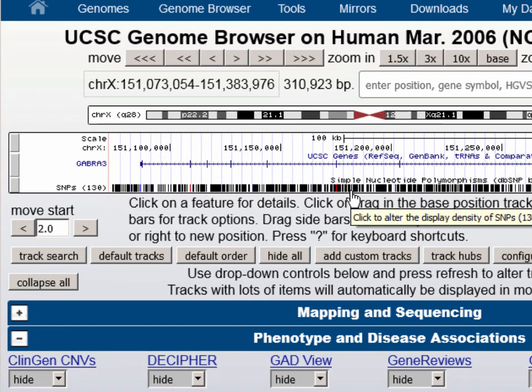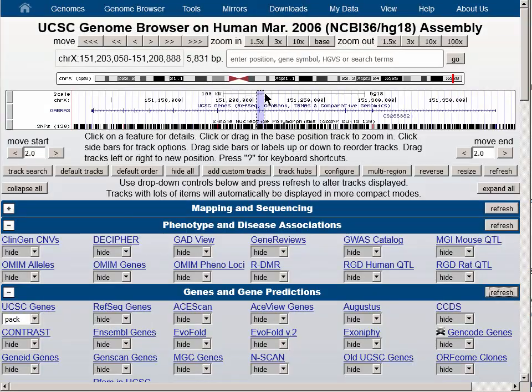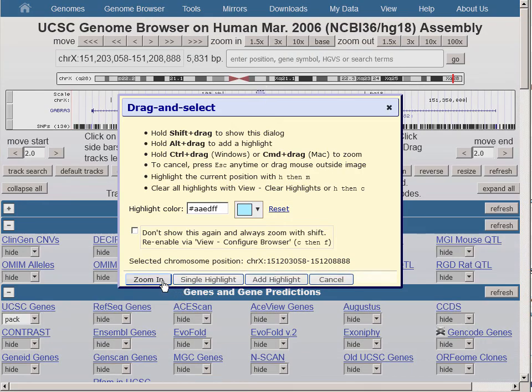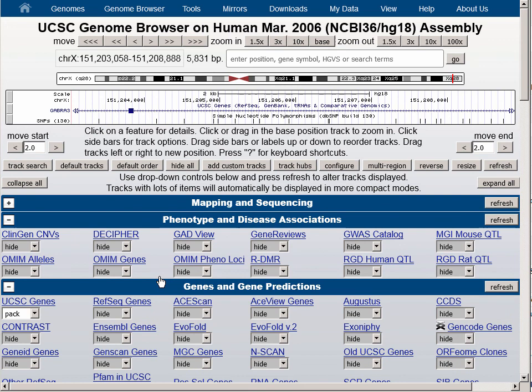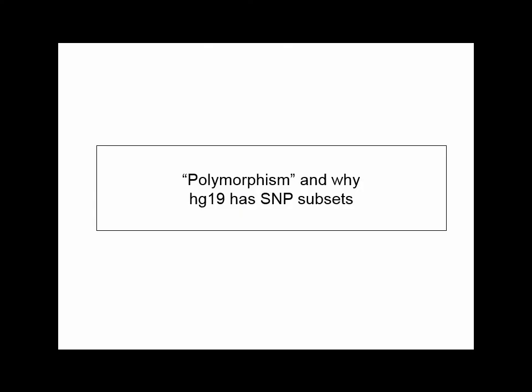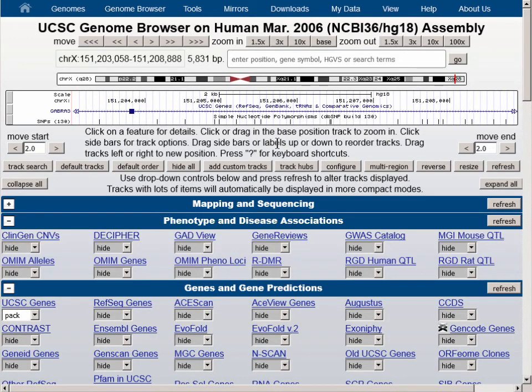Now let's zoom into one of the exons here in the middle of the screen, and you can see that at this resolution, around 5,000 base pairs, there are a dozen or so SNPs in view. Around the time of SNP 130, we learned something about the SNP track and the way people were using it that gave us some concern.